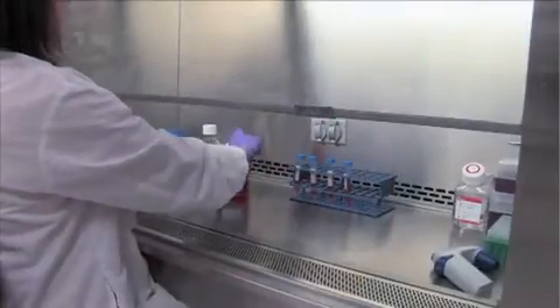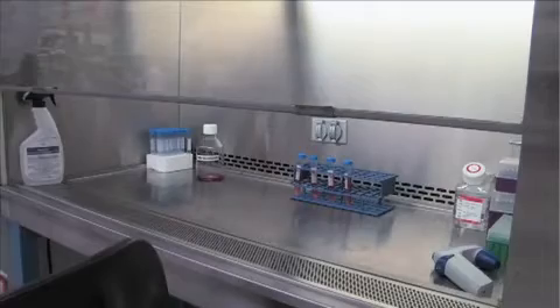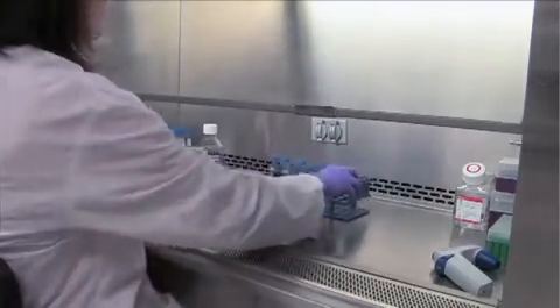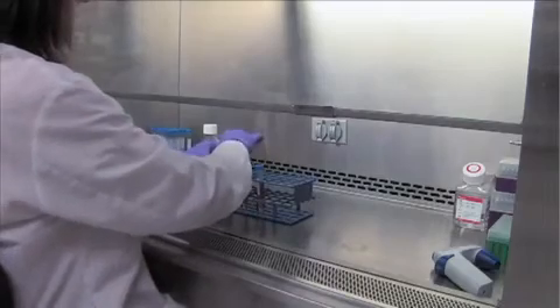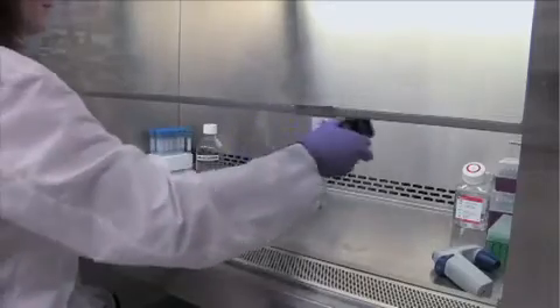When finished, make sure everything is closed tightly before removing from the cell culture hood. Anything opened outside the sterile field will now be non-sterile and should not be used for cell culture work. Wipe down the work surface with ethanol again and straighten up the hood before you leave.